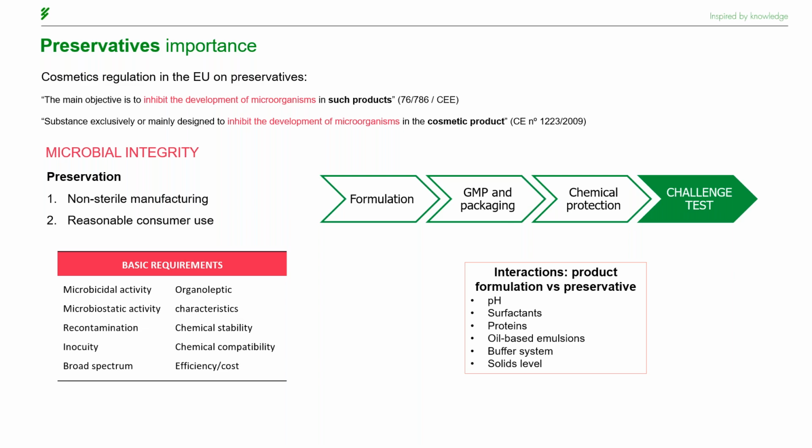So as well as their interactions with the cosmetic formula, for example, an alteration in the pH can change the ionic character of the preservative. Some preservatives combine with surfactants, which in some cases can impede antimicrobial activity. Some proteins found in the cosmetic formulation can inactivate preservatives.